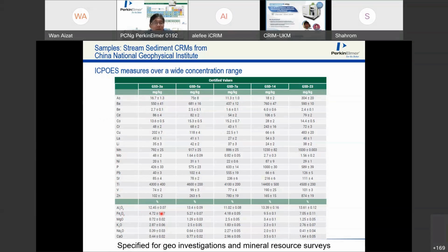If you run on ICP-MS and the lab is very dusty, environmental contaminants such as aluminum and iron can contaminate the sample. Therefore, for atomic spectroscopy like ICP-MS, keep the room clean. If the room is not maintained clean, these elements may go into the sample and appear as if from the sample, but in fact they come from the surroundings, table, dust, because these are elements from soil. Very easy to contaminate. So this is on ICP-MS.